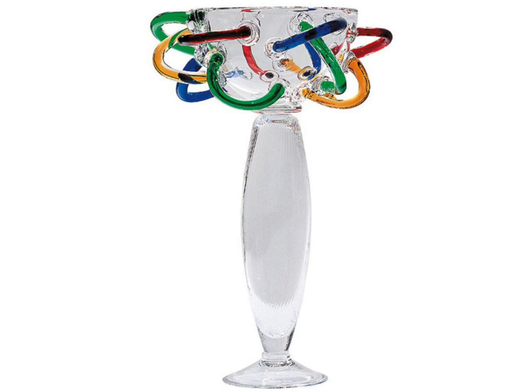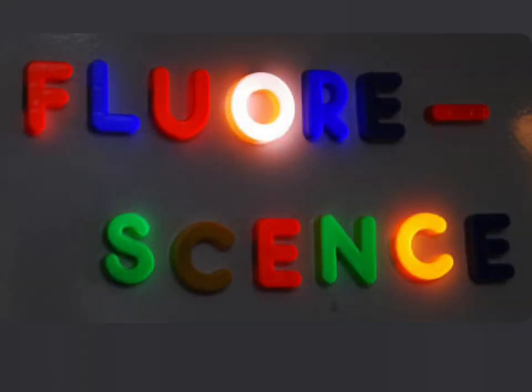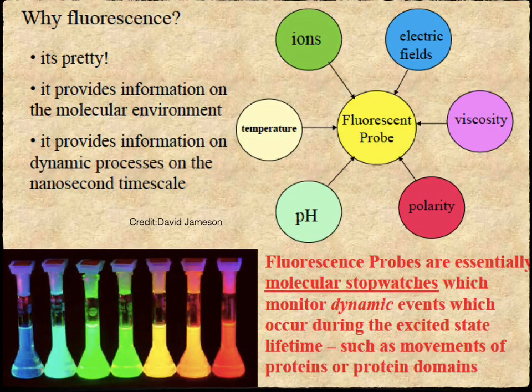The way we decorate cells and macromolecules in the last tens of years is called fluorescence. So we have specific molecules that can bind specific biological macromolecules, offering them the possibility to be seen by emitting a color, so some energies, when you shine other energy, say excitation light. A friend of mine, a pioneer in fluorescence microscopy, David Jameson, when we asked him why fluorescence, he replied, "Come on, because it's pretty."